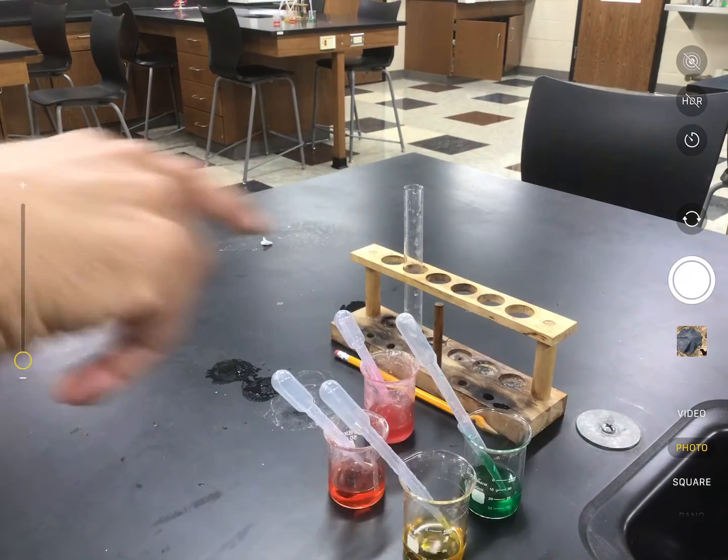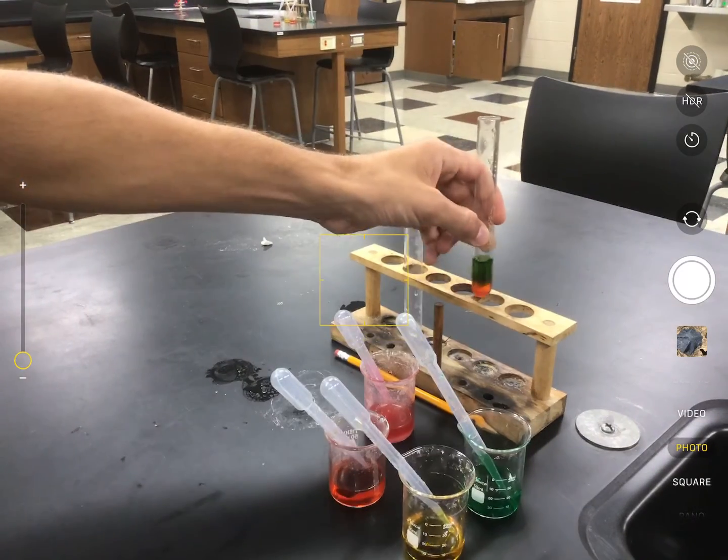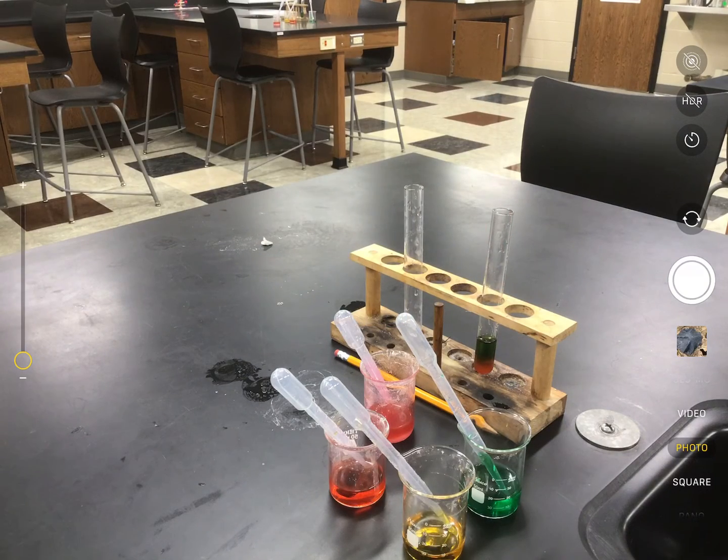So the salt doubled from yellow to orange to red. So based on that, that's the reason that we had all these different colors of liquids line up. And so what that tells us is how density relates. So the less dense something is, the higher up it's going to be floating, and the more dense something is, it's going to be closer to the bottom.